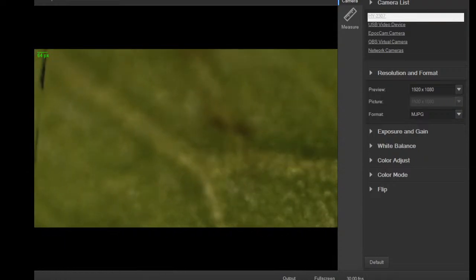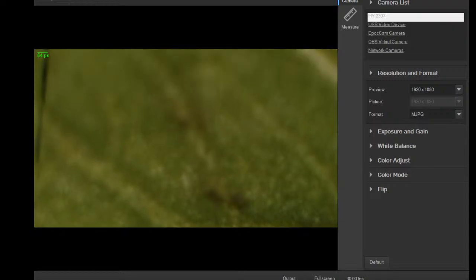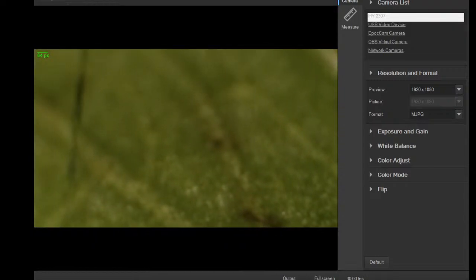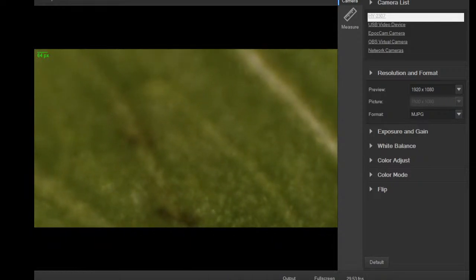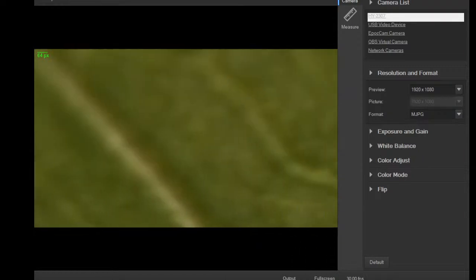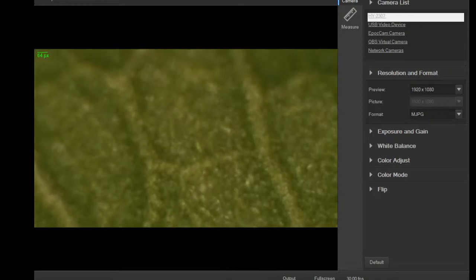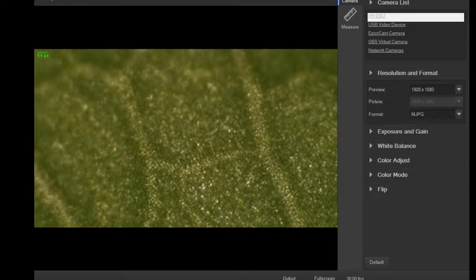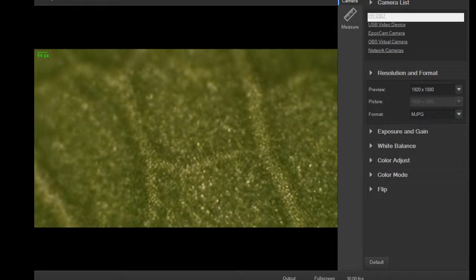So you can see the venation in the leaves there, just like any other leaves, as it pumps water and nutrients around the leaf to and from. You can see the individual cells there. They're kind of shiny. It's kind of a cool alien look there. Green, almost like veins popping out of the forehead of an alien creature.